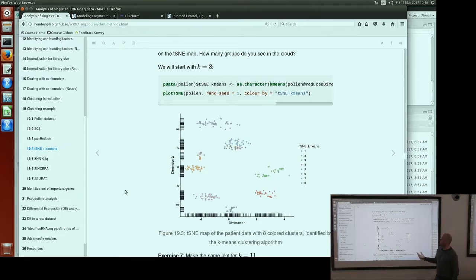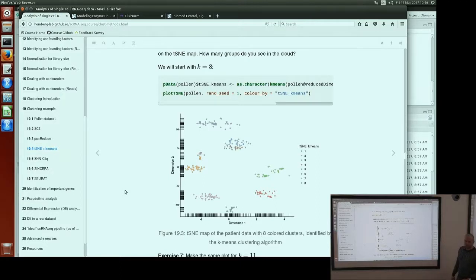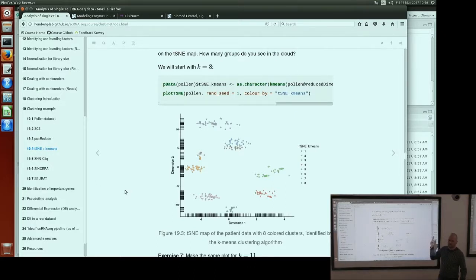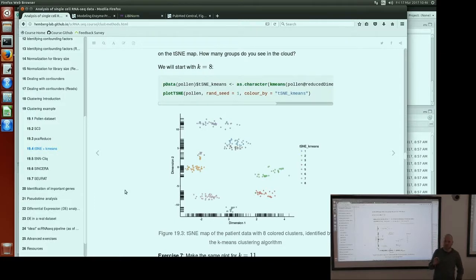K-means sometimes behaves weirdly — this cluster was split in two, with half belonging to one cluster and half to another. This one was also split in two. K-means is sometimes not performing well. But again, if you plot t-SNE of the pollen dataset, you find 8 clusters instead of 11. This is probably fine, because as we saw in SC3, k equals 9 was actually better than k equals 11 — there are three cell types which are very similar to each other. So k equals 8 is similar to k equals 9. T-SNE is okay for this dataset, but this dataset is very nice and clean, so be aware that not every dataset is like this.